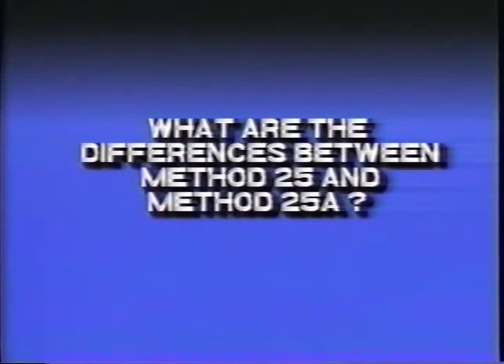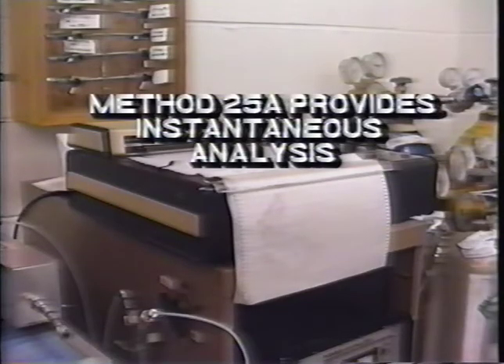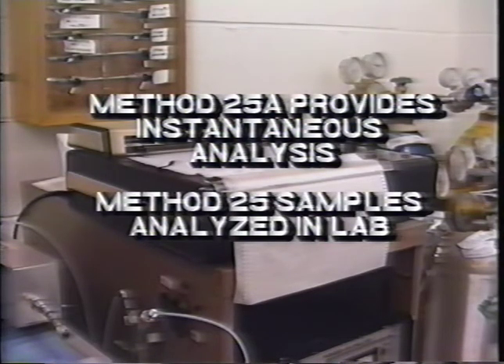What are the differences between Method 25 and Method 25A? Method 25A uses direct FID measurement of the sample. Therefore, Method 25A analysis of the inlet and outlet VOC concentrations cannot be compared because the mixture of organic compounds in the outlet may differ from the organic compounds in the inlet. Method 25A provides an instantaneous analysis, whereas Method 25 samples must be analyzed in a laboratory.